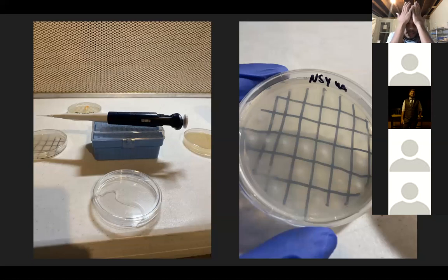Take your petri dish that you put all those drops of water on and put it in front of your flow hood without putting any parafilm around it. The clean air from the HEPA filter will go into your petri dish, and it'll dry up the drops of liquid that you put on there. Once the drops are dried up, put it under the microscope, and you'll easily be able to see the edges of your grid lines. Then you can look inside each grid and see how many spores are in the squares.